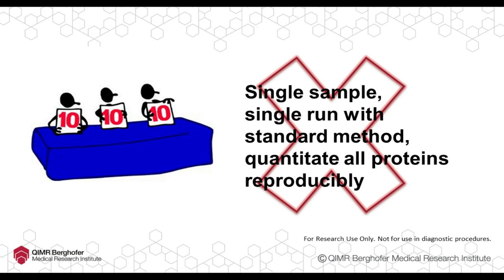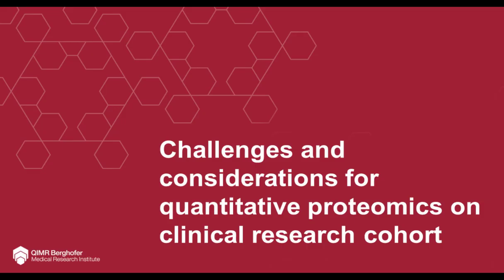So going back to our wish list, no, unfortunately, clinical proteomics research cannot really use a single method and a single run for standard samples, so we need to really be a bit smart on how we design our studies. So after that, technical considerations for mass spectrometry.